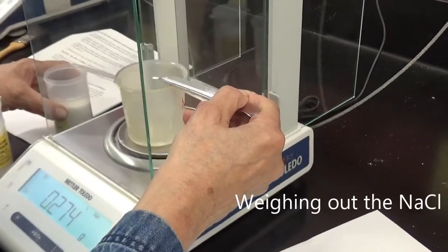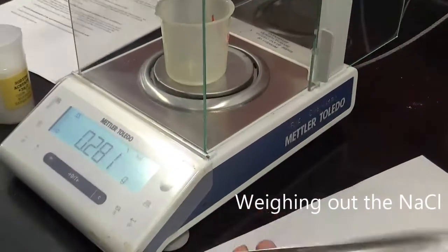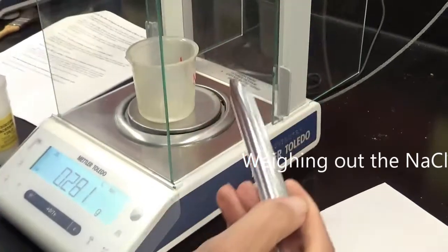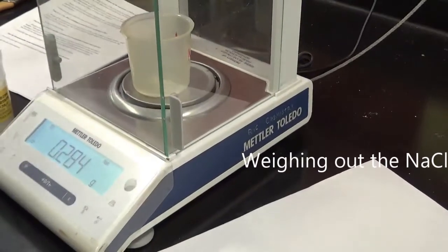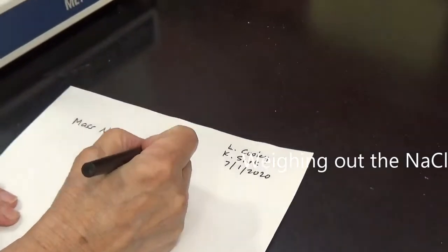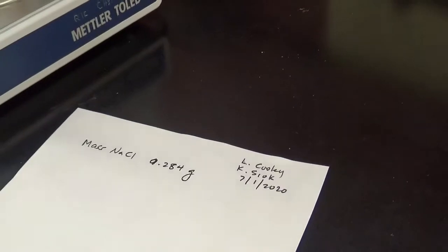Good. Well, it's fine. I'll do it a little more. Whatever. All right, so that's 0.284 grams mass of NaCl. Okay, now I'll do the acetic acid, the sodium acetate.